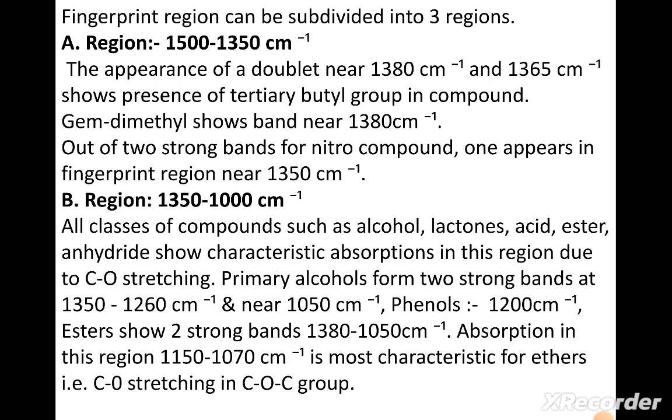Absorption in the region 1150 to 1070 centimeter inverse is the most characteristic for ethers, that is CO stretching in the COC group.